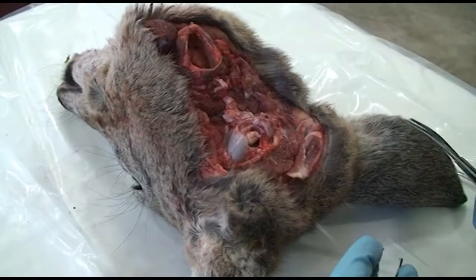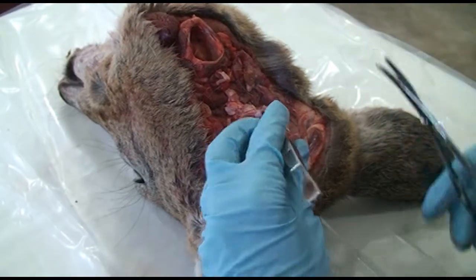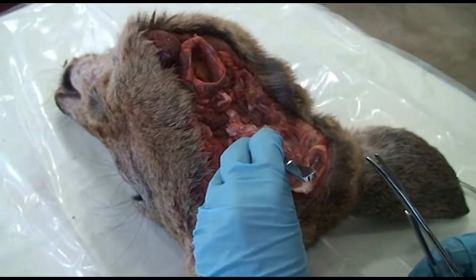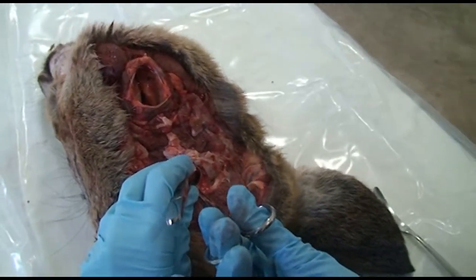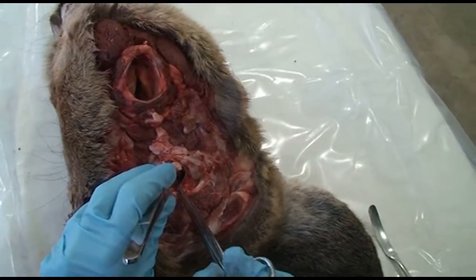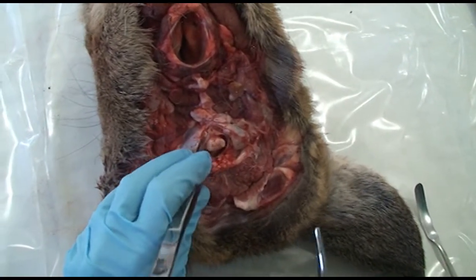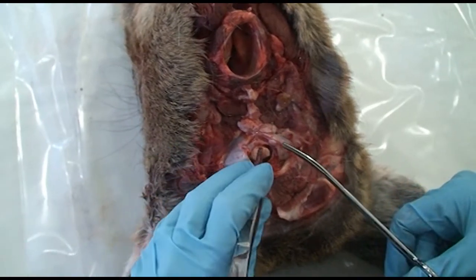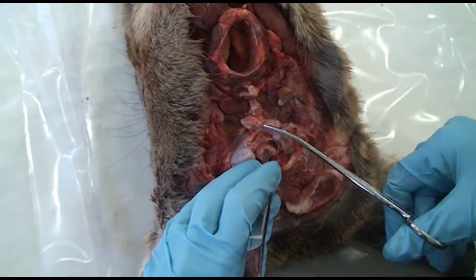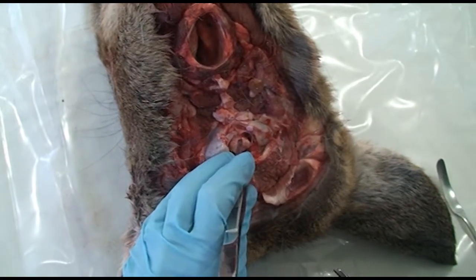The next step in the process is to remove the obex, which is a part of the brainstem. And you can actually see the part that we need. There's a little V right there. It's way shadowed in there. But my point is, it's not that far in there, and so you don't have a lot of room to play with. So you want to be careful with getting your brainstem out. And when they're in good condition, it certainly makes it easier.